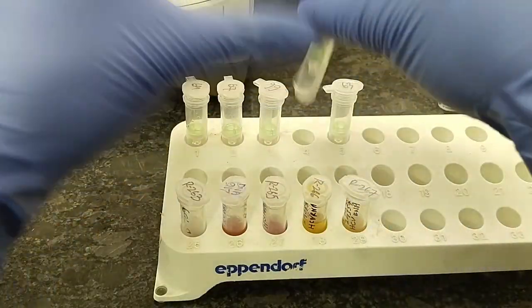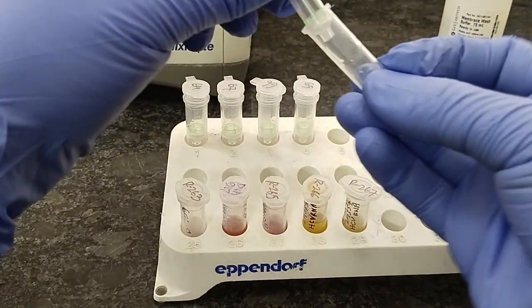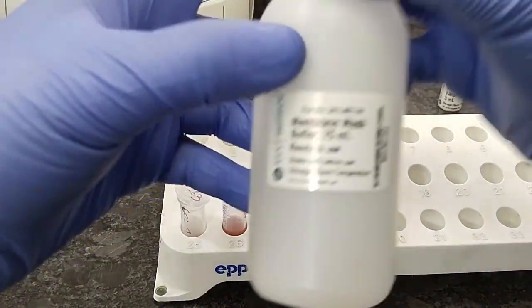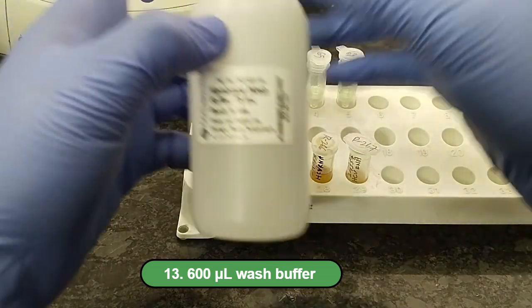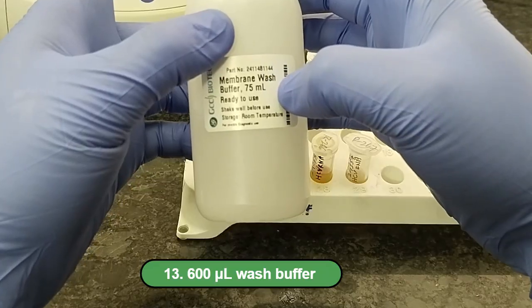Now the next step is washing. We use membrane wash buffer to wash the column. It is an alcohol-based membrane wash buffer.